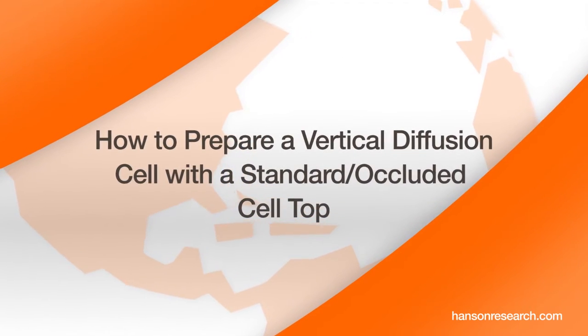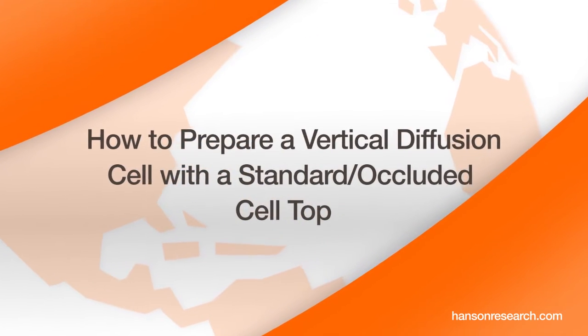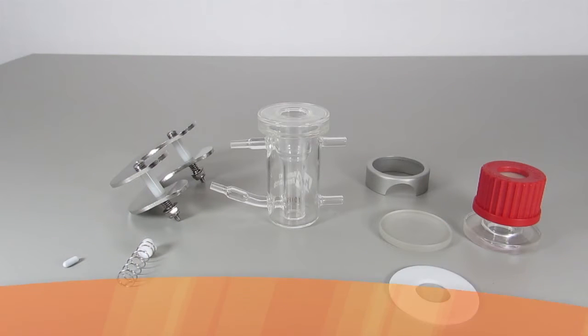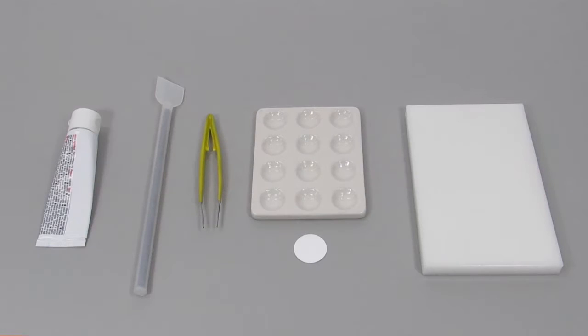How to prepare a vertical diffusion cell with the standard occluded cell top. The VDC components are: vertical diffusion cell, helix kit, clamp, cell ring, glass disc, dosage wafer, and open cell top. The tools and materials needed are: dosage, spatula, and tweezers.